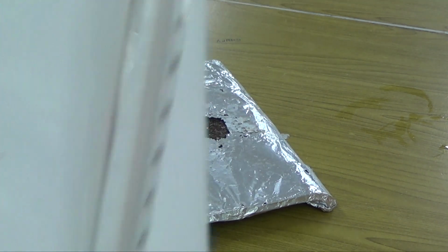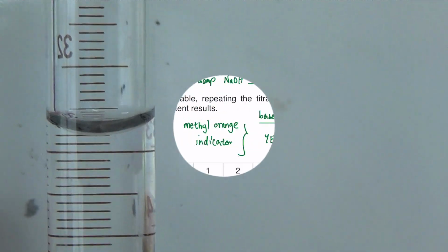So that is 32.8. I'm reading at an angle a little bit because the video cam is kind of slanted downwards. But if I move this up to horizontal level, you should be able to read this as 32.8. Make sure that when you read the burette reading, you can see it's 32 on top there and then 33 at the bottom. So that's 32.